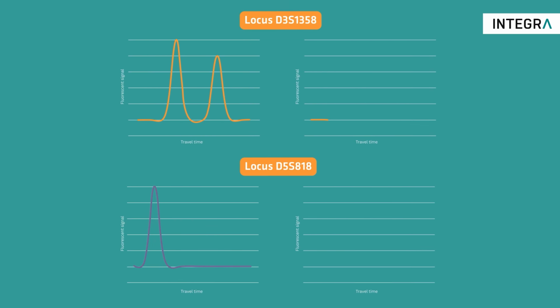The final step involves comparing the genetic fingerprint obtained with that of another sample.